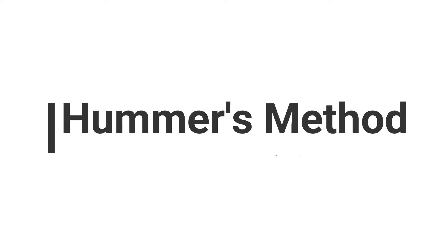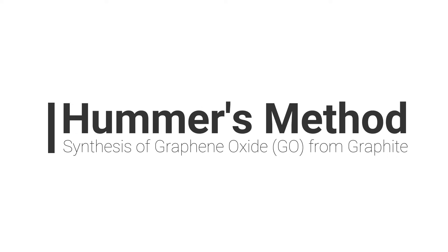Welcome to insta-nano.com. In this video we will learn the synthesis of graphene oxide from graphite via Hummer's method.